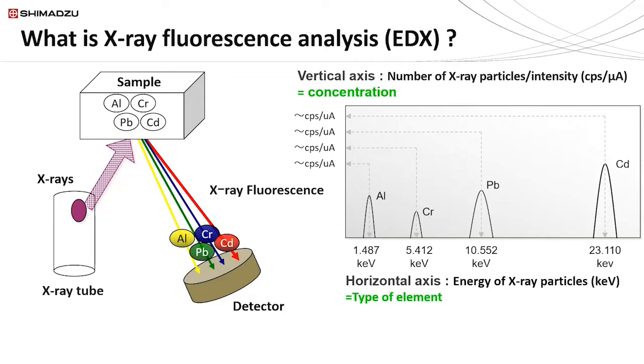X-ray fluorescence is an umbrella term that encapsulates both energy-dispersive X-ray fluorescence, also known as EDX, and wavelength-dispersive X-ray fluorescence, WDXRF. In the context of this talk, I'll be interchanging vocabulary with XRF and EDX, but in the context of this talk, XRF and EDX are the same thing.